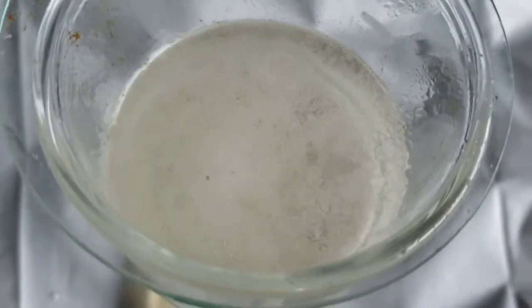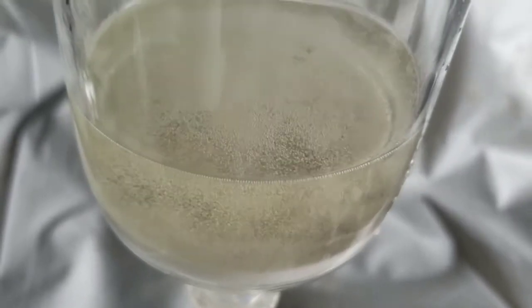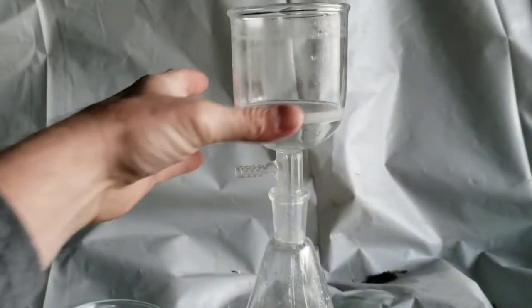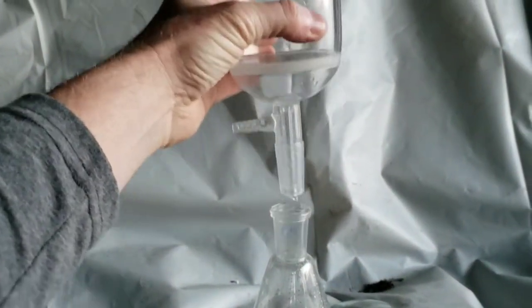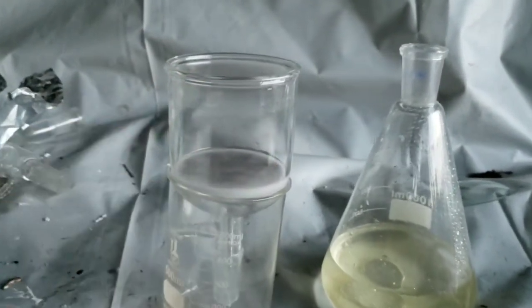The piranha solution keeps getting lower and lower, but just because it's run through the filter itself does not mean that it's not good anymore. So once it has emptied out, I remove the funnel and pour the solution back in.